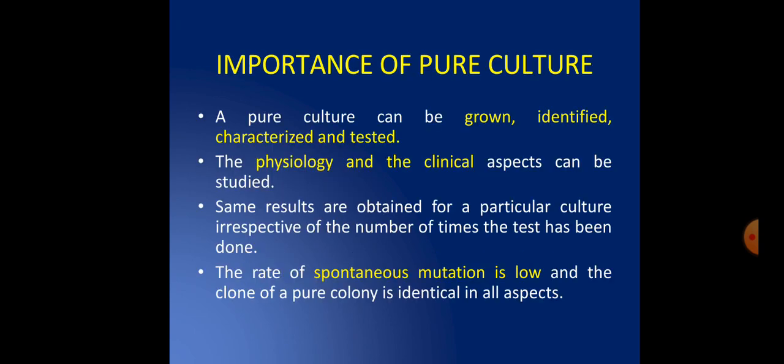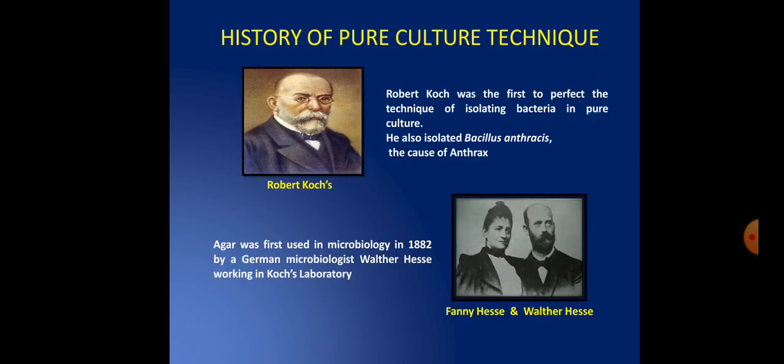Importance of pure culture. A pure culture can be grown, identified, characterized and tested. The physiology and the clinical aspects can be studied. The same results are obtained for a particular culture irrespective of the number of times the test has been done. The rate of spontaneous mutation is low, and the colony of a pure culture is identical in all aspects.